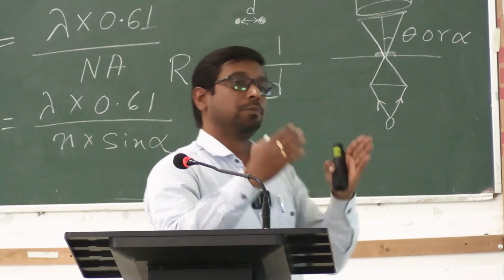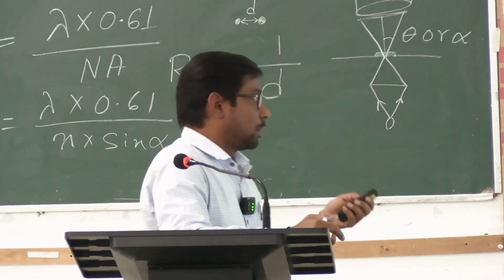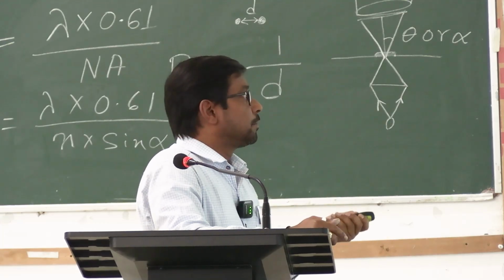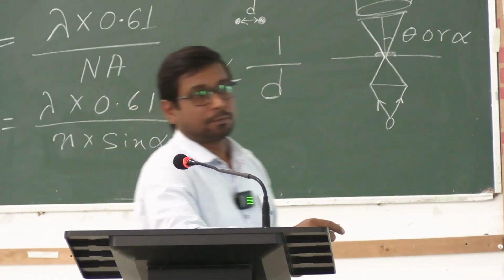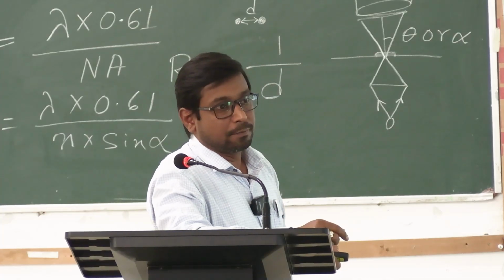But if we make it even closer, near the focus point, then what will happen? Then another image will form that is not a true image, right?